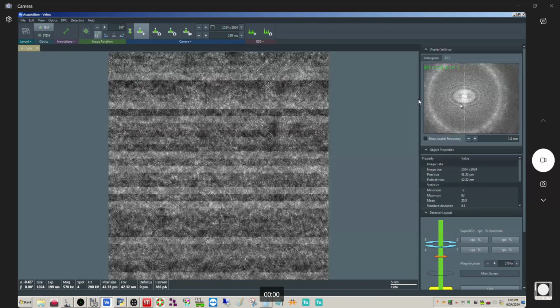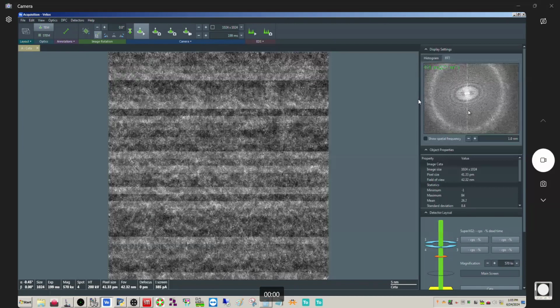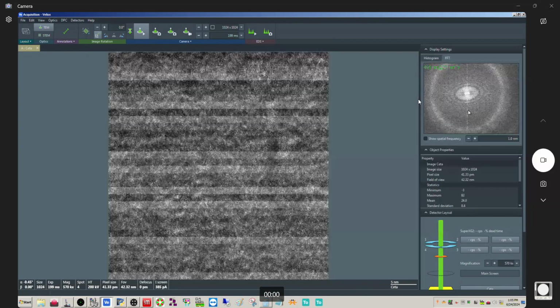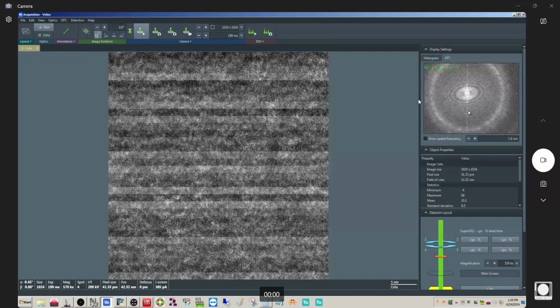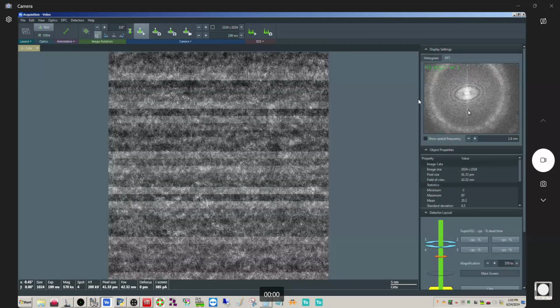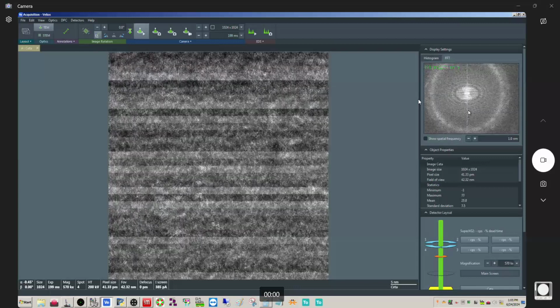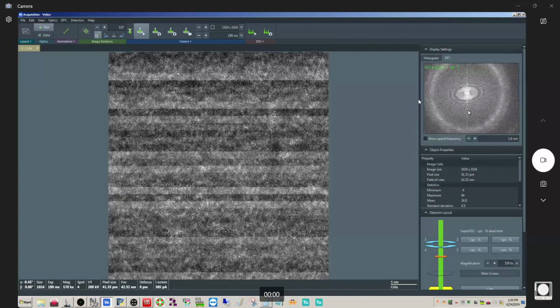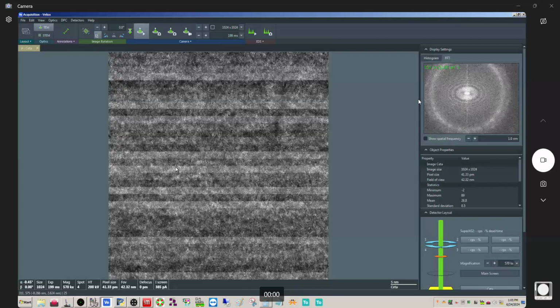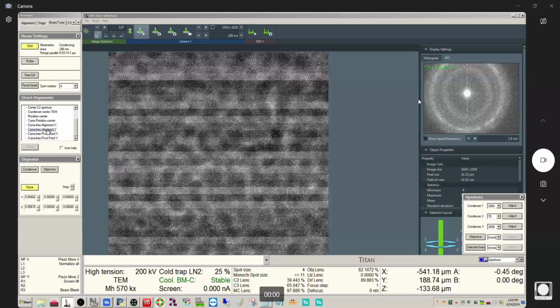You can actually digitally zoom in here a little. Yeah, that looks a little worse. Yeah, a little worse there. All right, that looks pretty good to me. Okay, so we're going to come back here, click done, and do the same thing for the Y.